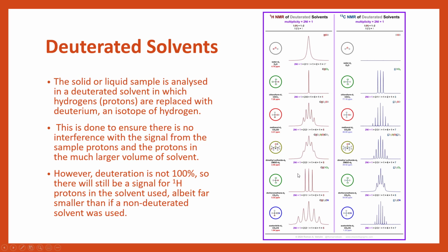As a supplementary piece of information, I've left a table of commonly used solvents and the peaks at which they appear on the Moodle page. Going forward, if you're ever doing NMR spectroscopy, it's something that is always used in the lab, so it's nice to have it.